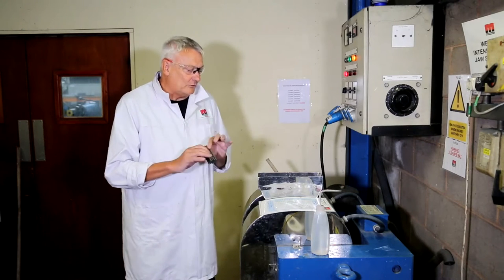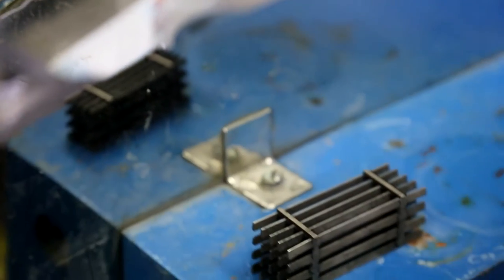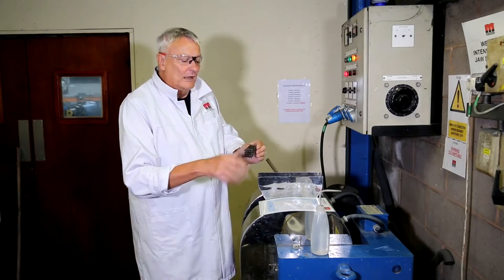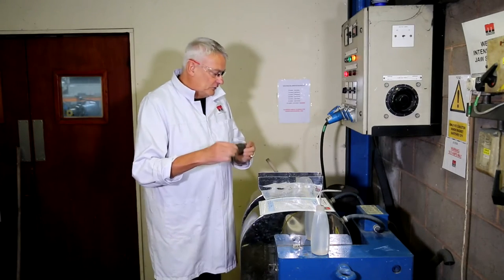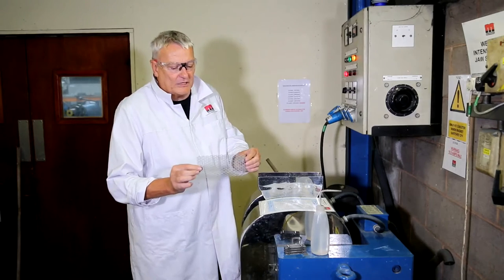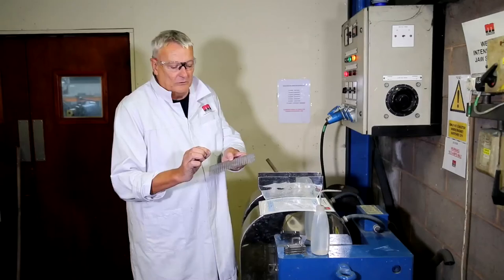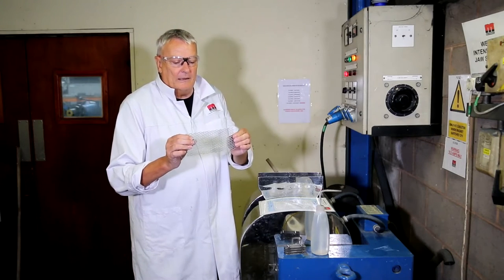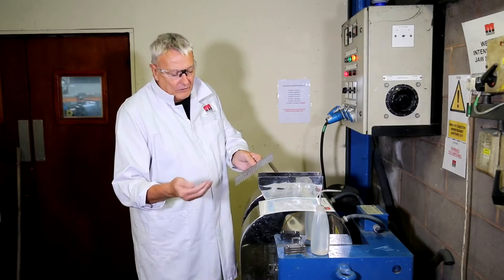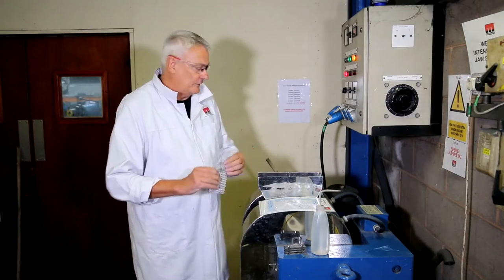There are various types of matrices that we use for different applications, and I have a few of them here to show you. This one is a wedge wire matrix, which is often used for iron ore processing. It has quite a high surface area and will capture a large volume of material if we are concentrating and upgrading an iron ore material. We also use what's called an expanded metal matrix, which gives much sharper points, providing high magnetic field concentration and allowing us to capture very fine, relatively low magnetic paramagnetic material. It's often used for silica sand processing, for removing one or two percent of iron oxides from silica sand.